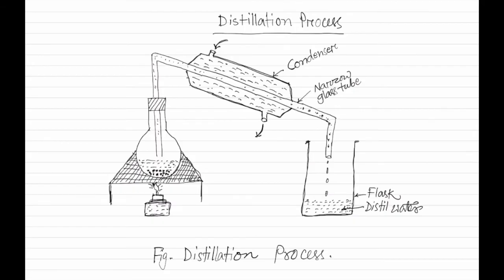And one of them is the spirit lamp that produces heat. Spirit lamp or lamp. With the help of this spirit lamp, you can give a definite amount of heat that is necessary for vaporization.